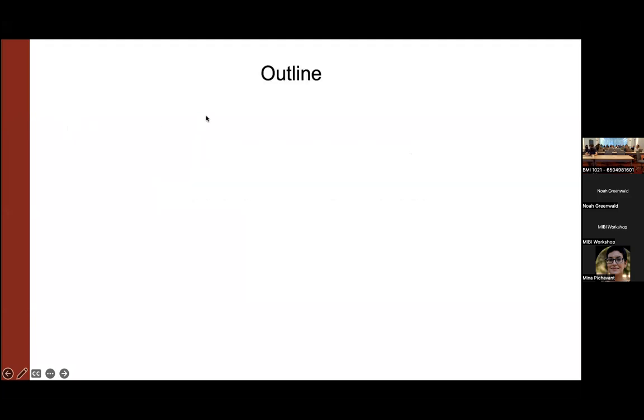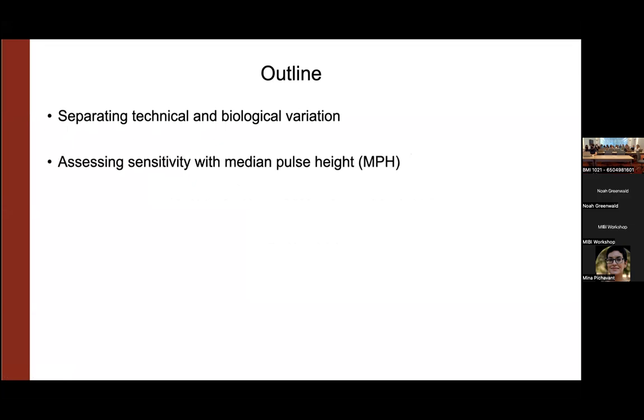Okay, great. Thanks, everyone. So wrapping up this session on MIBI processing, I will be telling you about the approach that we have developed for accurately assessing the sensitivity of the MIBI instrument. Brief outline: I'll give a background on what it means and how we think about separating technical variation from biological variation.